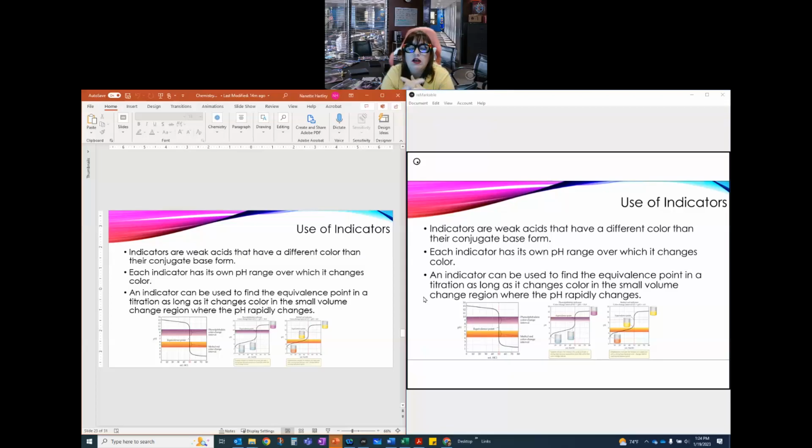It's on the north wall, and it talks about what color it is in acid, what color it is in base, where its pKa is. Because in order for us to be able to use it as an indicator, we need to hit that titration for that acid base, the indicator itself, after the equivalence point for whatever we're trying to look at. So it has to come after the fact. Now, depending on what indicator we choose, it may not be that close, and so we're going to have an error that comes from that.